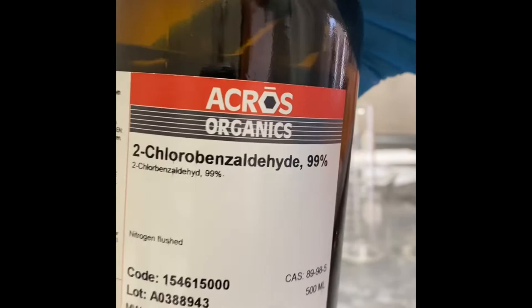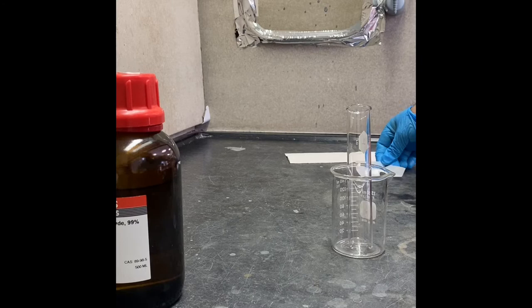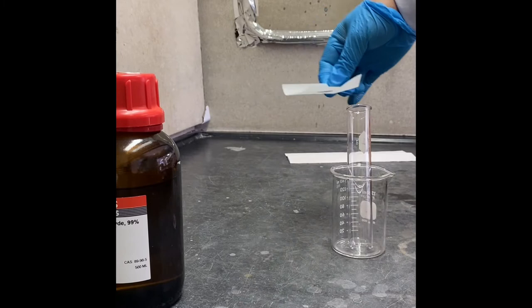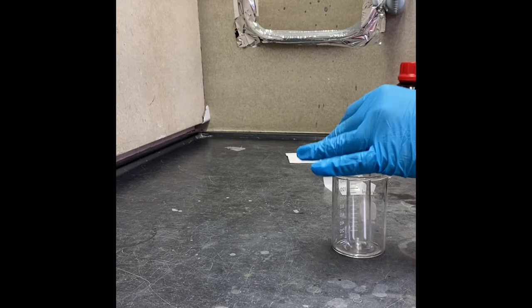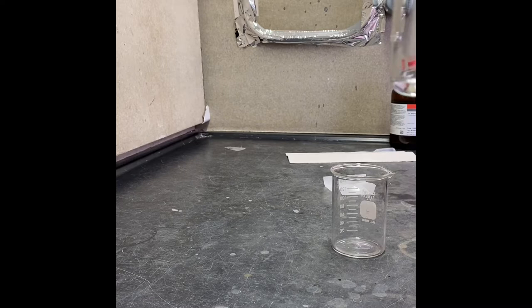We're going to do the Cannizzaro reaction today. We're going to use 2-chlorobenzaldehyde and potassium hydroxide crushed. I will use 2 milliliters of 2-chlorobenzaldehyde and I'm transferring that to my reaction flask.